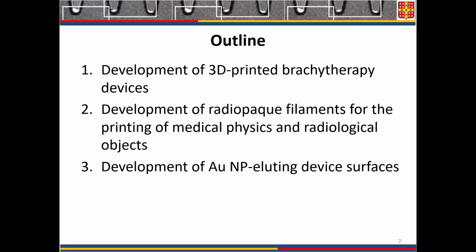And this application calls for a bioprinter because we develop gold nanoparticles that we use as an enhancer of radiation therapy for medical physics. And instead of injecting gold nanoparticles directly in the small animal, we have been using more and more hydrogels, applied at the surface of a brachytherapy device. Brachytherapy devices are radioactive implants that are inserted in the body for radiotherapeutic treatments.